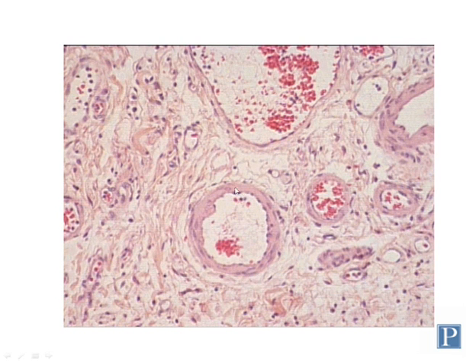In this section you can see a small artery here. Just a couple probably arterioles over here, and then this would be a small vein. Notice the size of the red blood cells look quite a bit smaller. Again, the small artery here has a more regular shape to it, thicker muscular wall. In this case there's at least 5 layers of smooth muscle, which is why we would classify this particular blood vessel as a small artery. Here is the small vein that has a couple layers of smooth muscle on its wall, but again the tunica media is not quite as well formed.